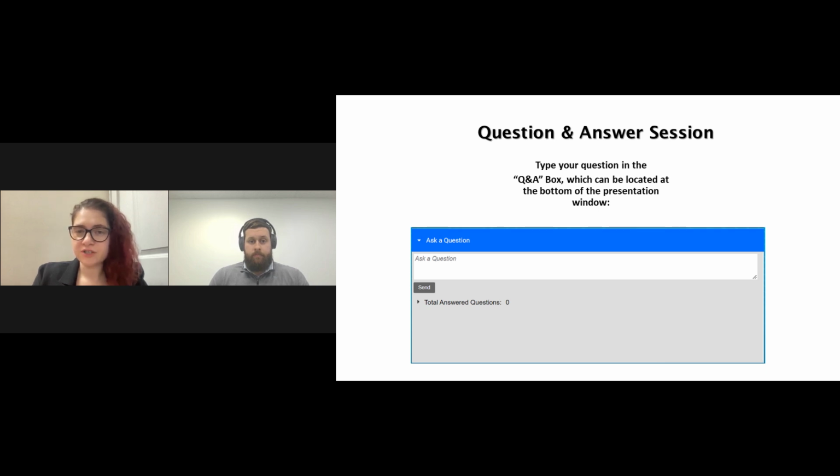Okay, great. I have a question here asking, is the software charged in the tablet? I think I understand that question in terms of, is the software installable onto the tablet? The short answer is yes, we can install the software on the tablet. We typically provide a PC for every instrument with our operating software because it has the necessary memory space and processor for data acquisition and data analysis. We typically don't recommend the tablet for total control of the instrument. We prefer to use the tablet for the remote display app, which gives you a quick glance at the Brevis GC-2050 current status and conditions. You can also run inlet maintenance from the tablet. But we typically don't recommend using total software control with the tablet, though this can potentially be installed onto a tablet.